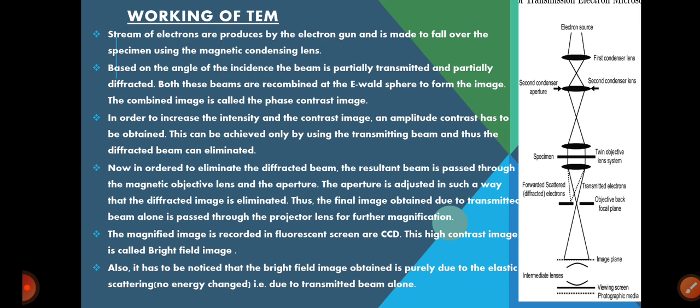After this, next we have the scanning electron microscope, and one more, the transmission electron microscope, where we can get the image on the fluorescent screen, that is a black and white screen. And one more, in this transmission electron microscope, the image we get gives information about the structure of the specimen and also the internal structures of the material, in the nanometer range.